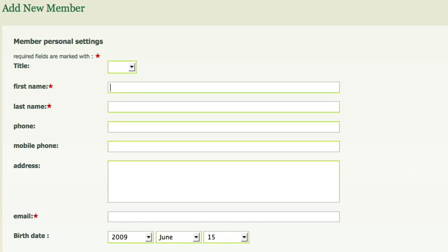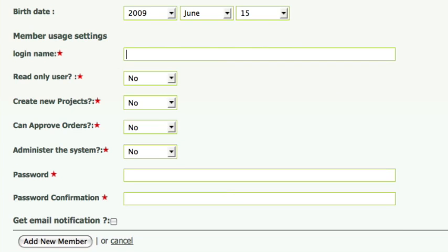Today I'll add Jason Turner as a new member. He will be in charge of the lab order materials. I need to enter Jason's first and last name as well as his phone number and email address. Jason will be able to update the rest of his information later.